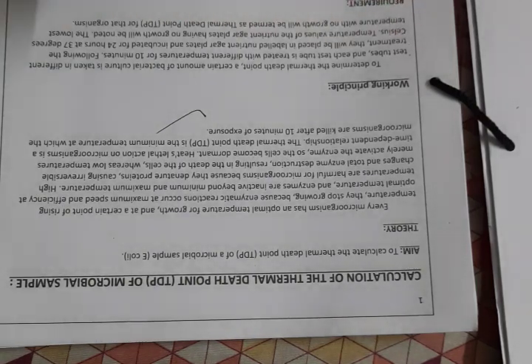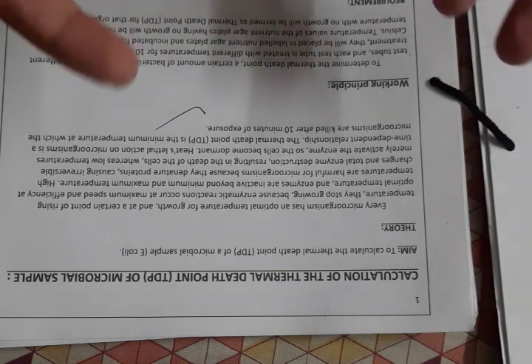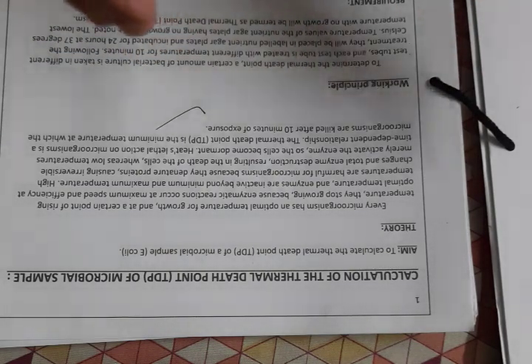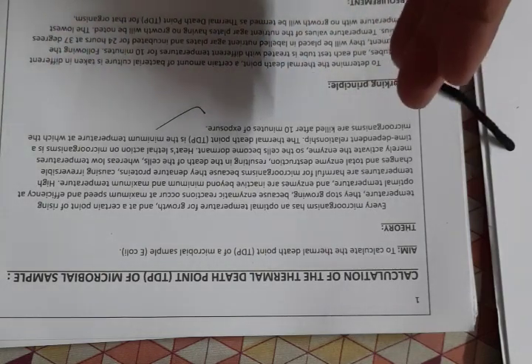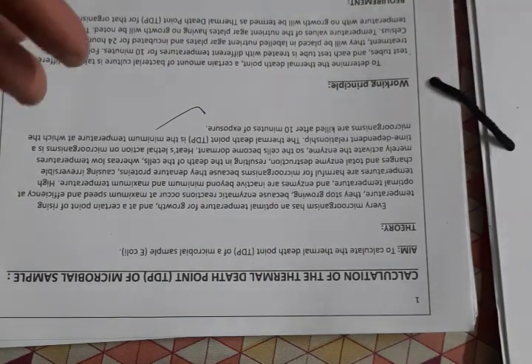But after a certain temperature, the enzymes get denatured. So after a certain temperature, the organism starts dying or stops reproducing. And thermal death point is such a minimum temperature at which, if the microorganism is kept at that minimum temperature for 10 minutes, then after that it cannot reproduce or it gets killed. And that is the thermal death point.